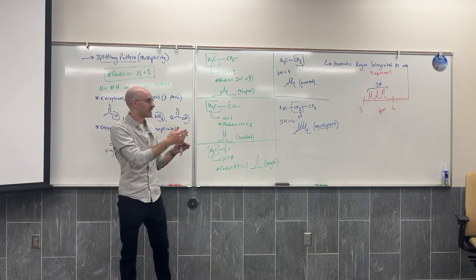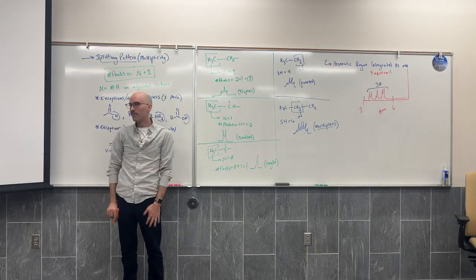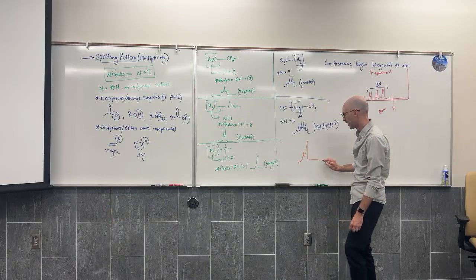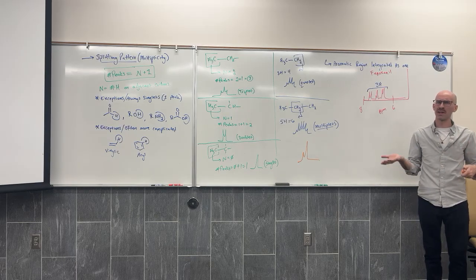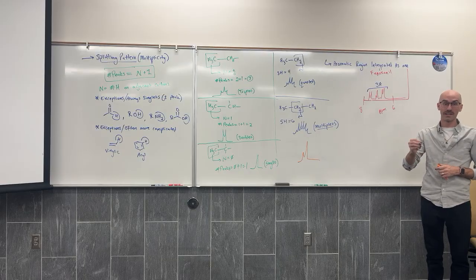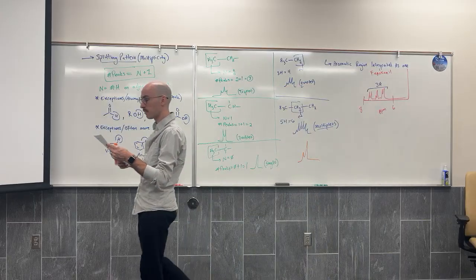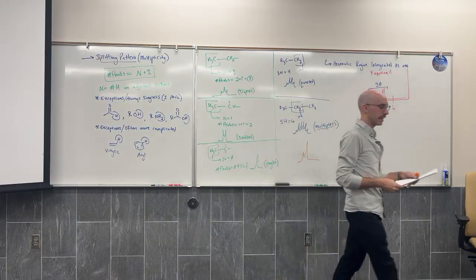So there is always that symmetry, except that experimentally, no. Sometimes you find a doublet that kind of has symmetry, it's got the 2 peaks, but one is oddly shorter than the other. This can often just be an experimental issue, something to do with the instrument. So you won't always find it. But when you start looking back at these examples, you'll start to see it a little bit more clearly. You'll start to see the shapes that are in here.